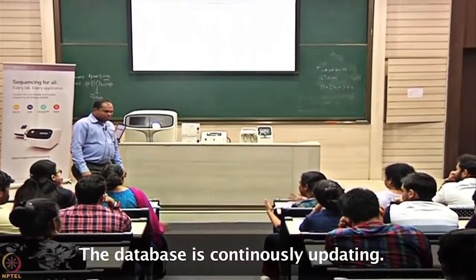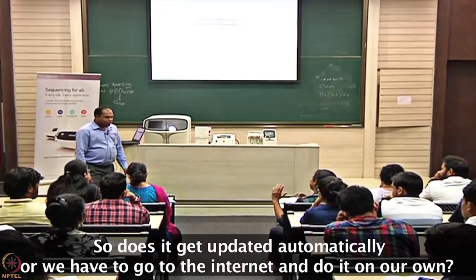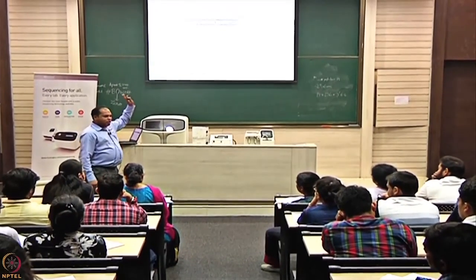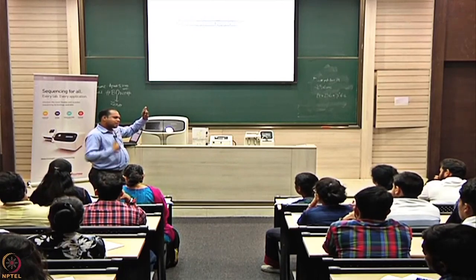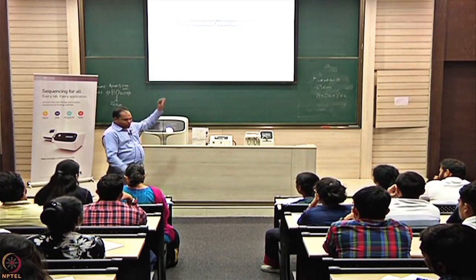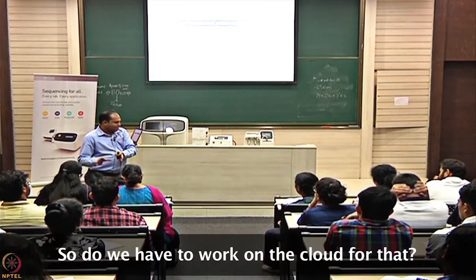The database is continuously updating. The software that is online is already updated. Whenever there is an update coming in, every 3 to 6 months, it gets updated onto the cloud system that we have. When I was talking about Ion Reporter, it already has certain databases available over there.